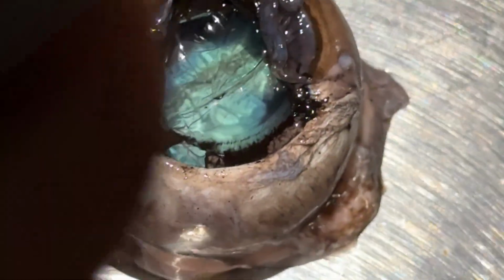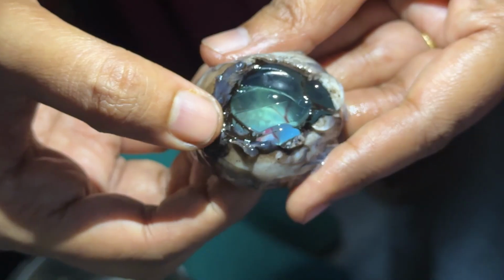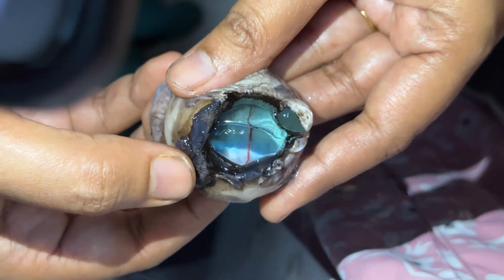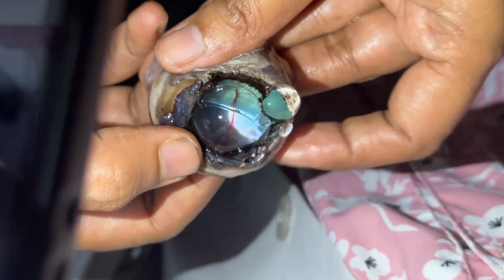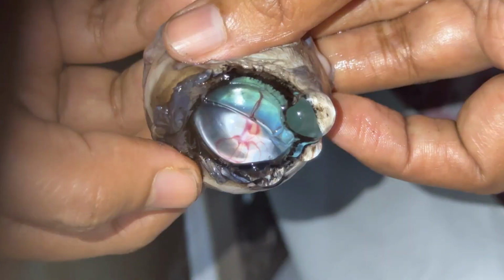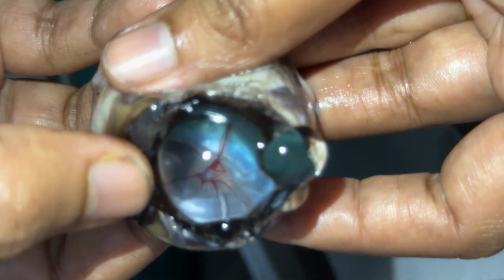Flash, can you please? Same structure. That is the optic disc. This optic disc. Light. That is the optic disc.